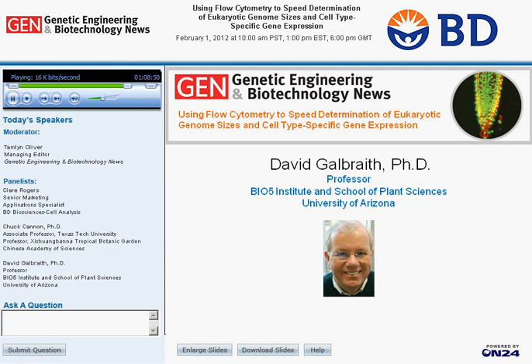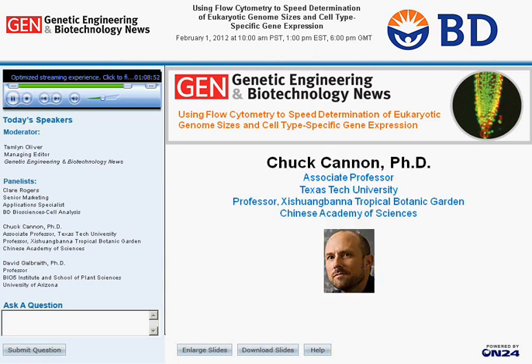All right, Chuck, do you think the chopping process can be automated? Again, I think that depends a lot on your question. So if you're doing something like in a crop species, I think you could get a very standardized material that you're using and a very standardized way of dealing with that material. And you could possibly automate it, but I think my student found that was one of the key steps in doing a more coarse filtering, chopping instead of getting really fine material. So I think it's almost like getting the feel for it.